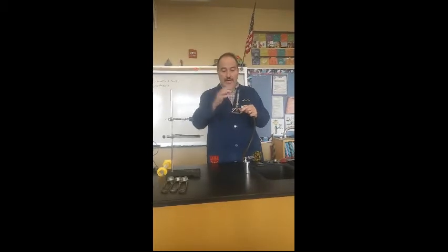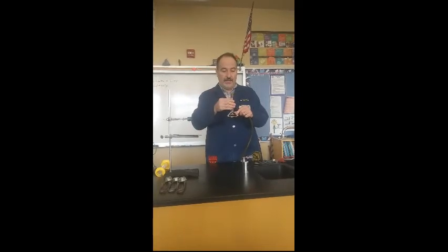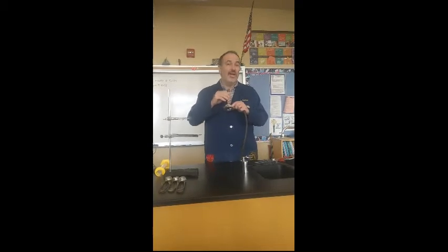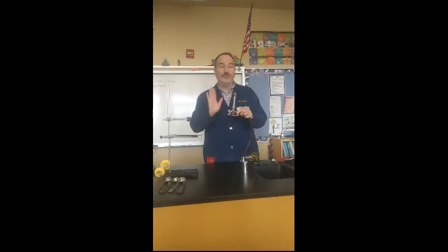have the tip. Now, of all the parts of this, when this is lit, you can touch everything, move it around, everything like that, except the brass tip. This is the only part that while it's on, if you touch it, it'll burn you. The barrel gets a little warm, but it's not going to get hot enough to burn you. It's insulated. You'll be fine.